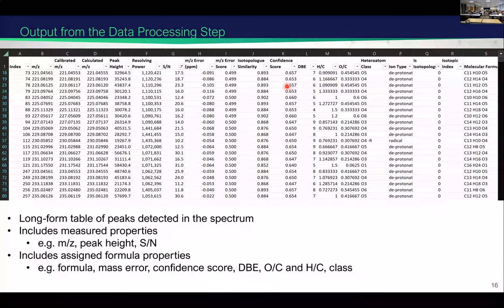For Thousand Soils, the form that's up now does not have that information. It's certainly available for those that want it. We just didn't want to confuse people that weren't expert ICR users. So if you ever want something that's not available online, just email us and we can provide it for sure.